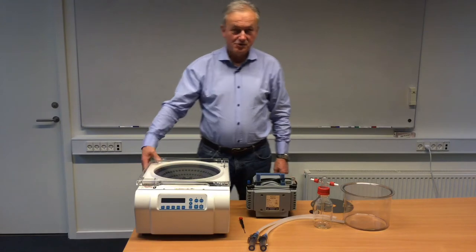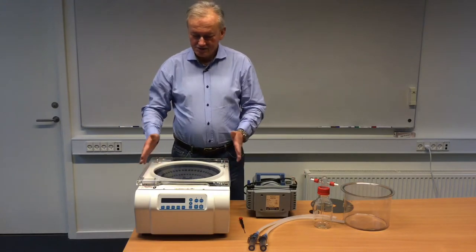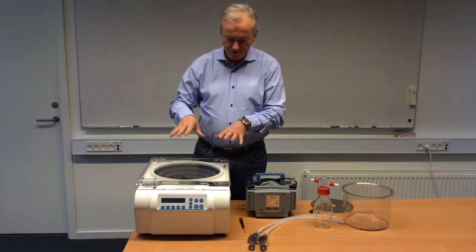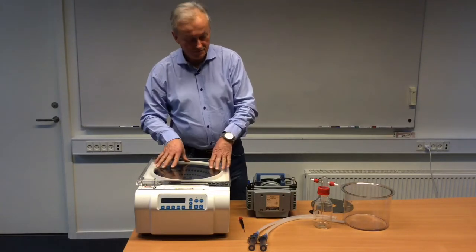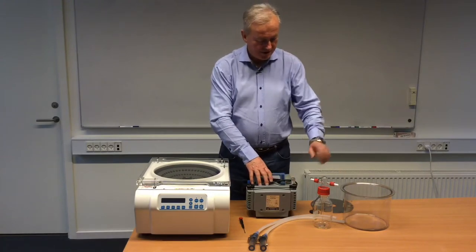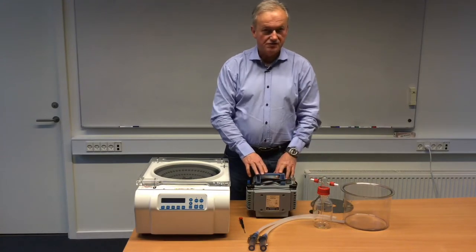Hello, my name is Jesper Scharstein coming from Laboutine in Denmark. Today we will introduce you to the Minimak Beta system, which consists of a ScanSpeed 32, chemical membrane pump, and a drip catcher, along with all necessary hoses to do the connections.